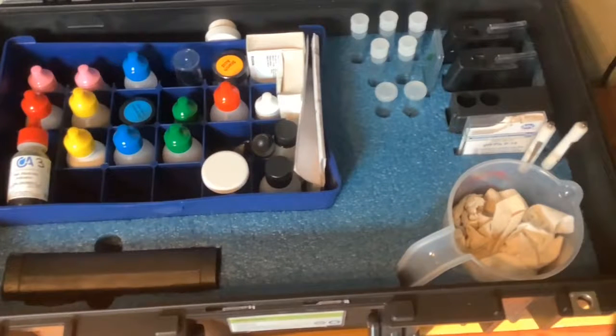The foam in the test kit can be easily cut and molded with a knife to fit different pieces of equipment. Be sure to properly measure before cutting to ensure that everything fits snug.